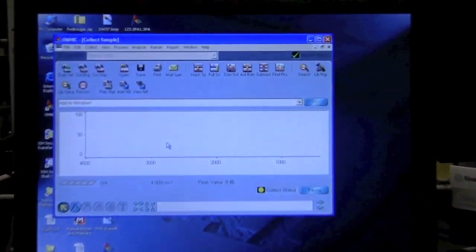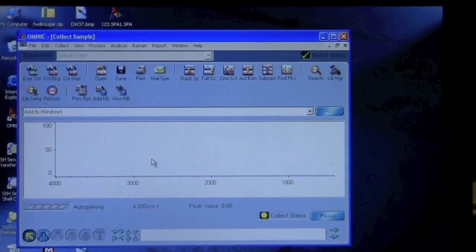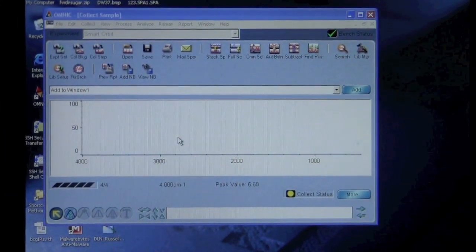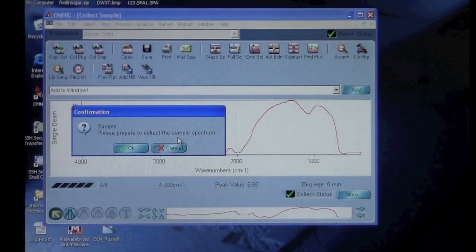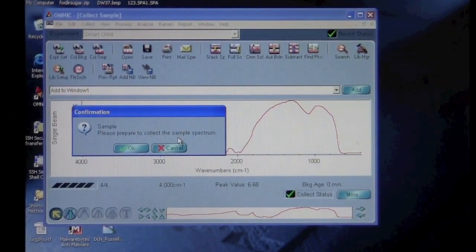It should collect the number of scans that you set for the background. After it finishes collecting the background, it should say prepare to collect the sample spectrum. Now we can go back to the cell.